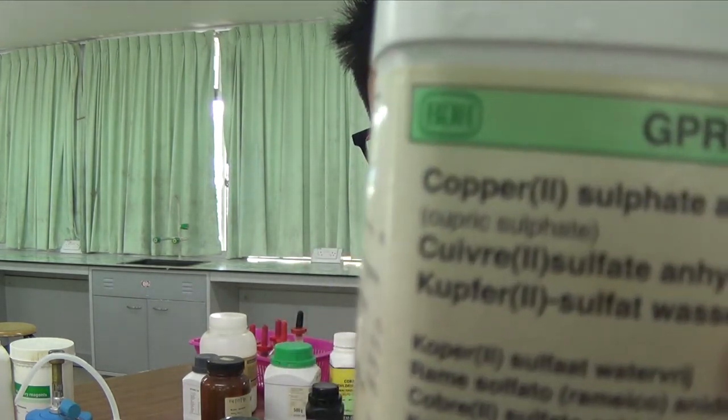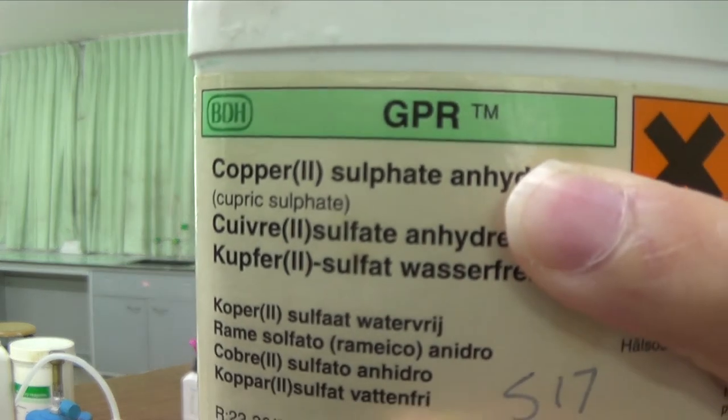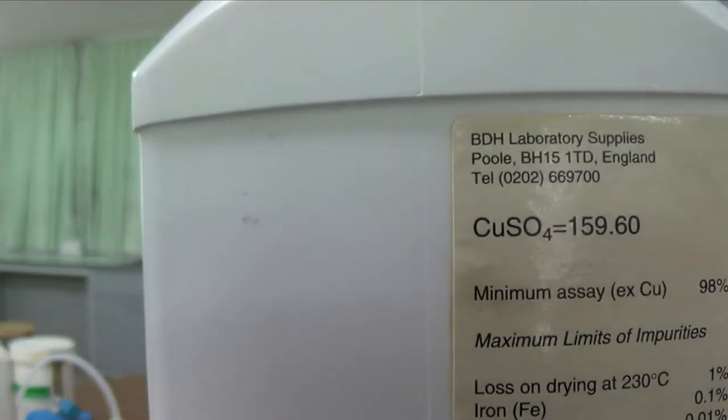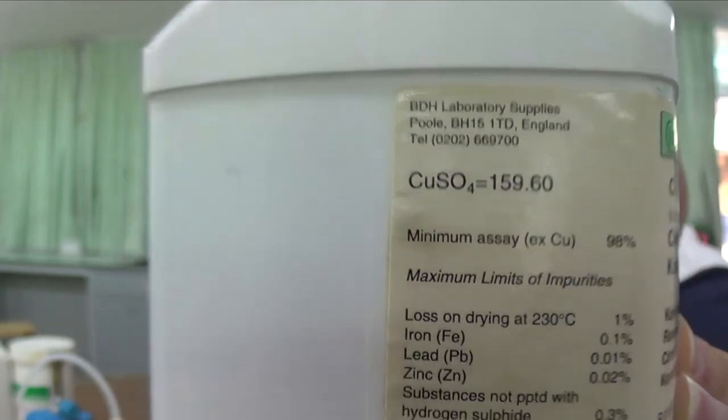I do actually have copper 2 sulfate anhydrous. Anhydrous means no water of crystallization. And let me look at the molecular mass. You see, they only label it as CuSO4 because that's without the water of crystallization.